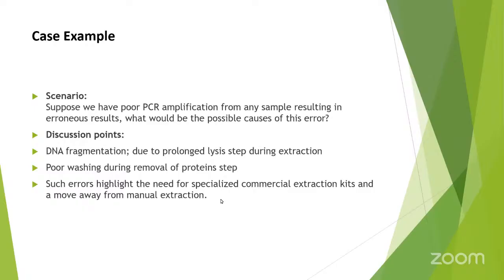There might also have been poor washing during the removal of proteins. Such errors highlight the need for specialized commercial extraction kits, a move away from manual extraction.